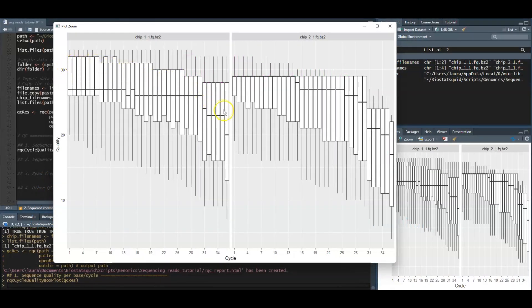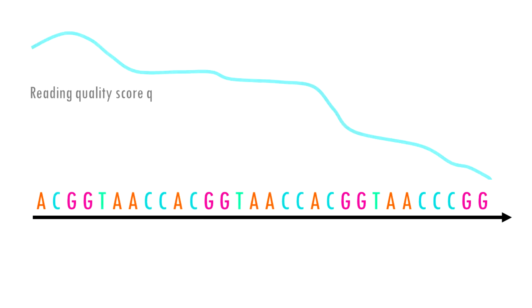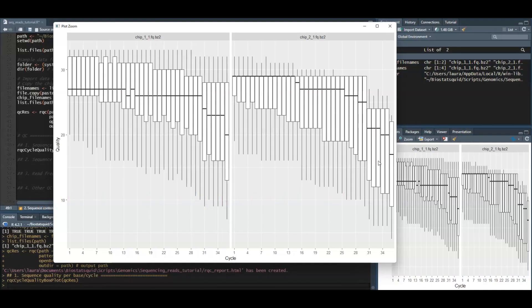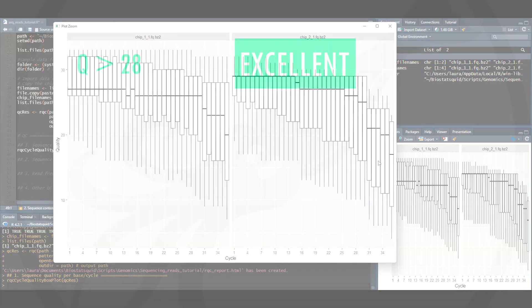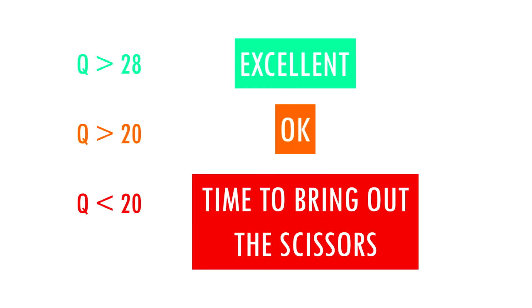You will often see that towards the end of the reads the quality usually goes down. It helps us decide if we need to trim the end of the reads later on because we cannot really trust the sequenced bases towards the start or the end of the reads. In general a good sample will have median quality scores per base above 28. If scores are below 20 towards the end, then you can think about trimming the reads.